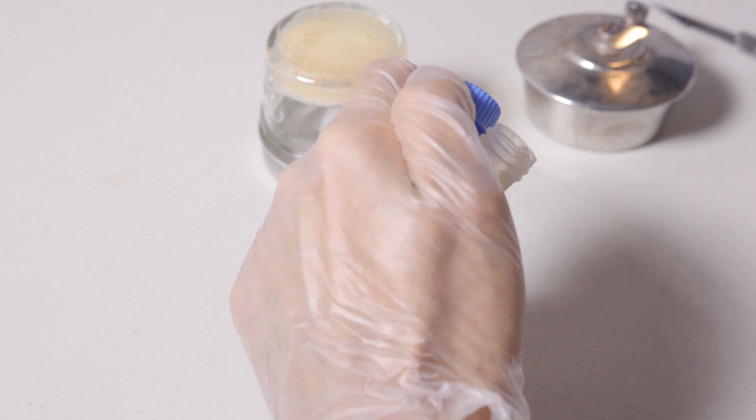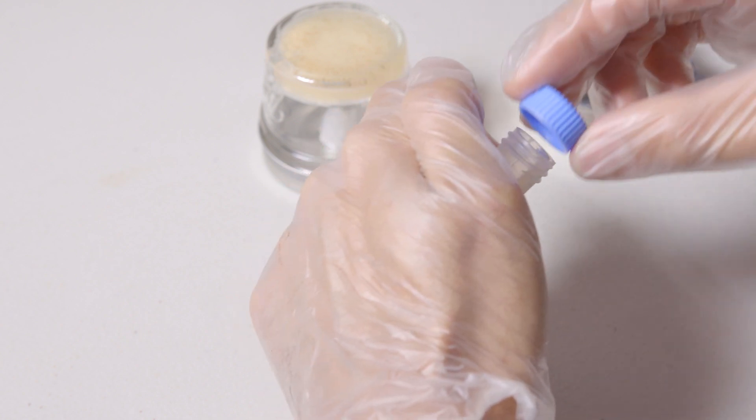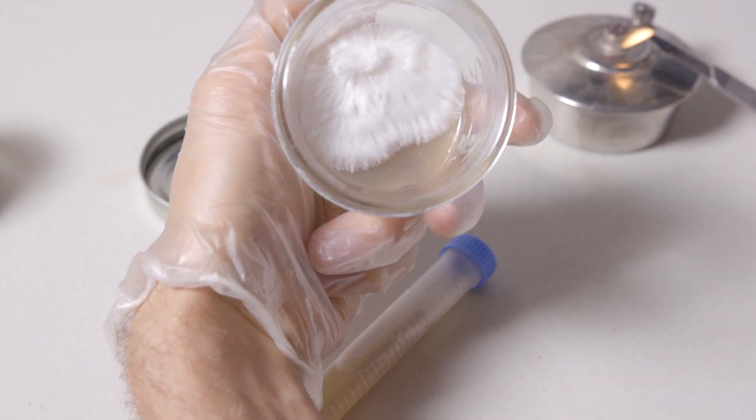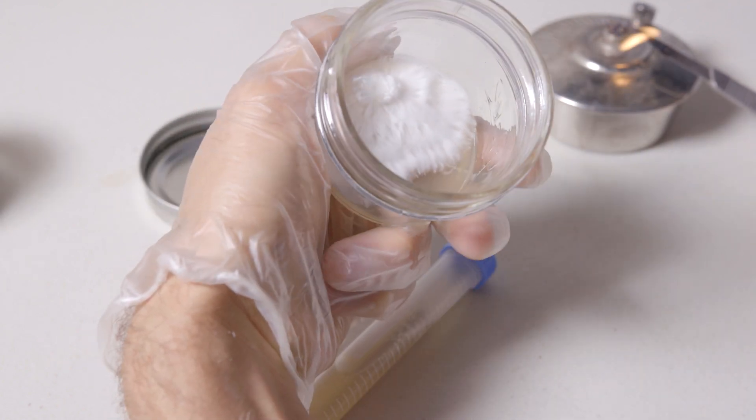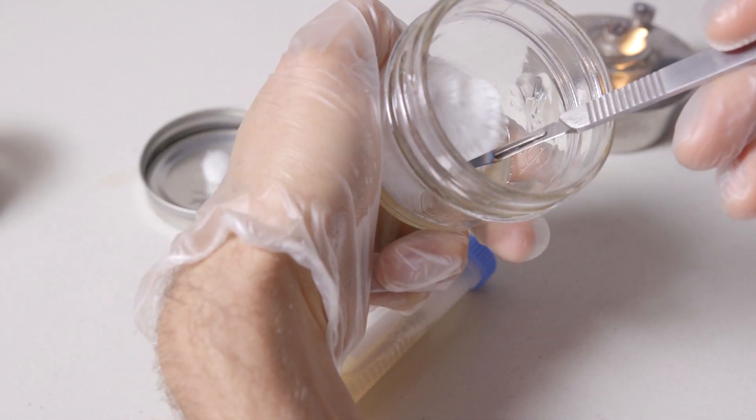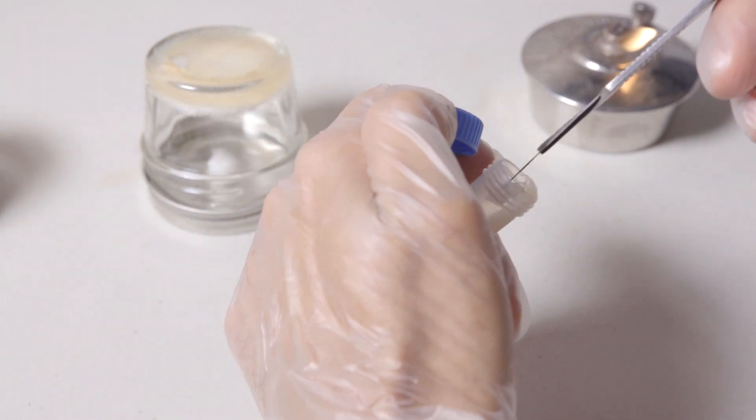Here I poured my agar plate a little bit thick so I was having trouble getting the wedge into the slant. With this plate on the other hand, I poured the agar pretty thin so when I took my transfer, I'm able to put it into my slant relatively easily.